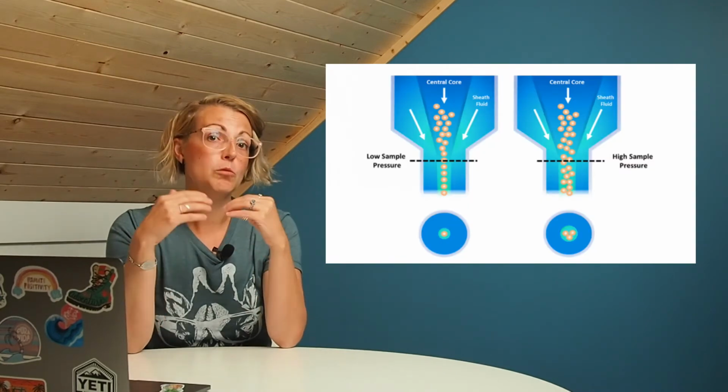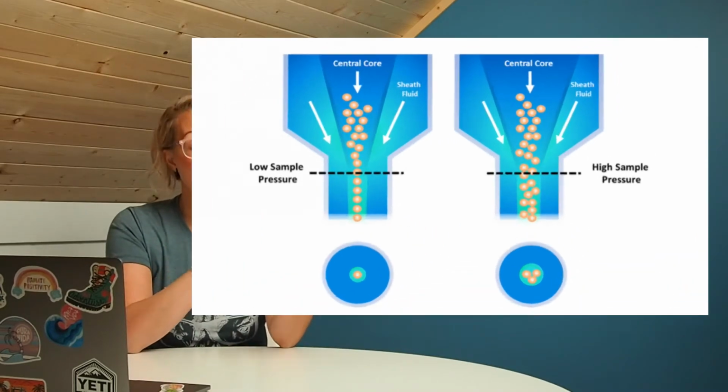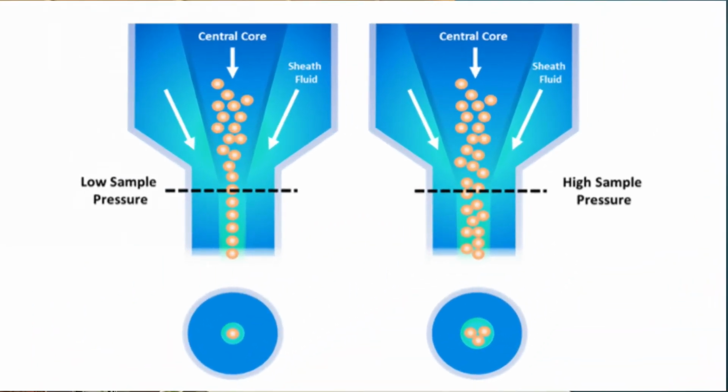through the machine. On every flow cytometer, you're going to have the capability of changing your speed. Now this will be potentially buttons that say low, medium, and high, or it could be a toggle switch inside the software to change your speed. Either way, the effect is the same. In order to get a faster run of your sample through the machine, you're pushing your sample through the machine at a higher pressure. So essentially, the different flow rates increase your sample pressure, which increases the width of your flow core where your cells are going through, that central stream.